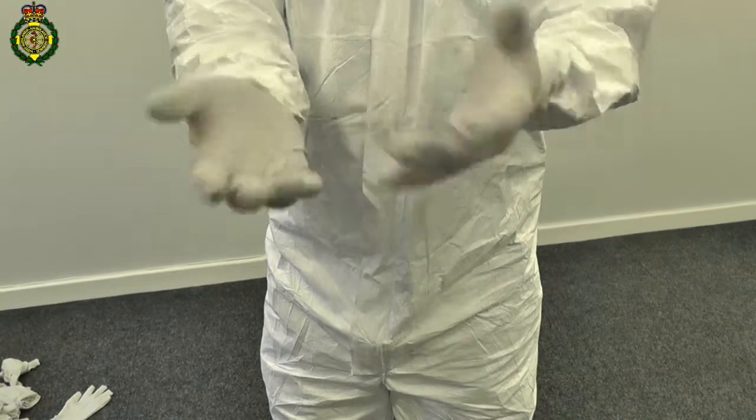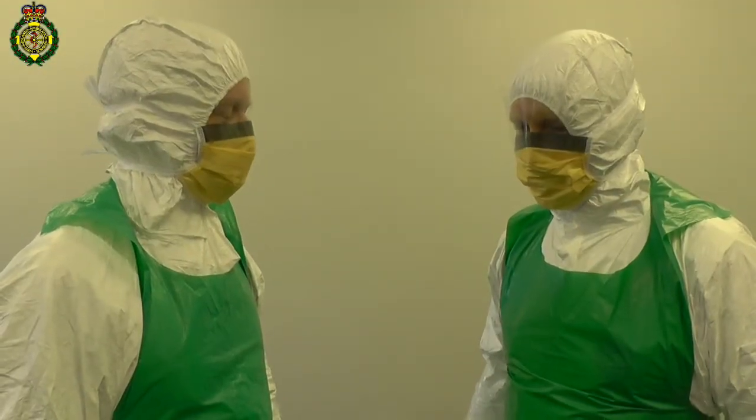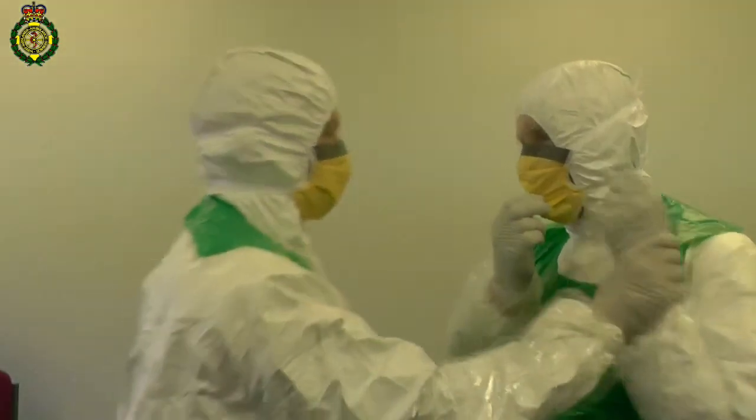Remember to change your outer gloves often so as not to contaminate items. Though these suits can get quite hot, never try to undo any part of the suit. Never touch your face or feel the urge to wipe your brow.